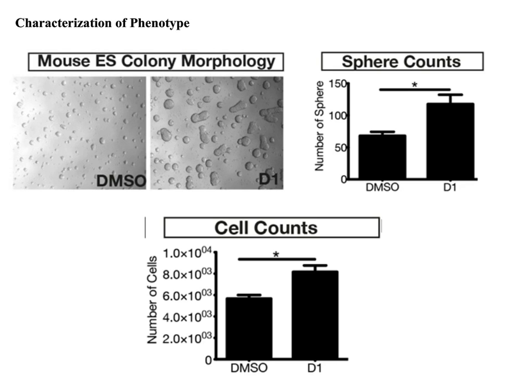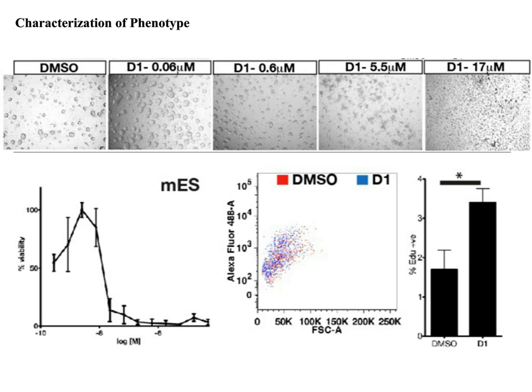And when we did a dilution series with these compounds, we could see that the compound produced an increase in proliferation at a lower concentration. And as you increase the concentration, it was toxic. This was done both as an image-based characterization as well as by quantifying ATP. So the percent viability graph that you see is also a reflection of the image-based analysis that we did.